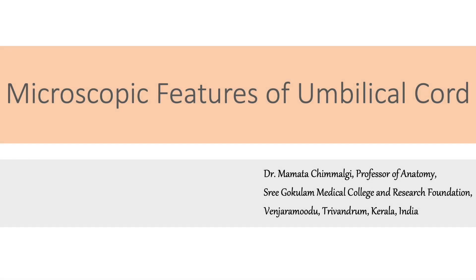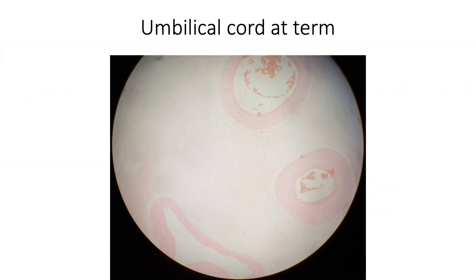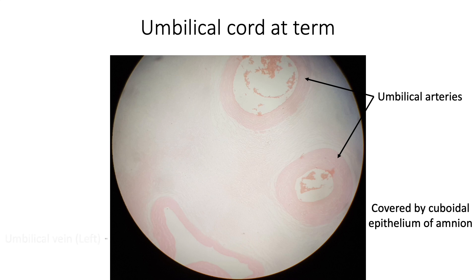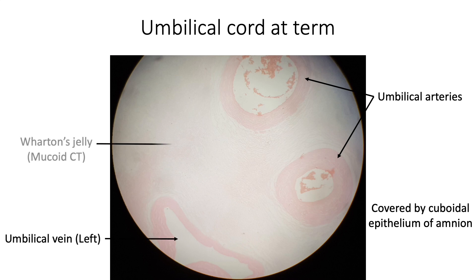In this video, let us consider the microscopic features of the umbilical cord. The umbilical cord at term is covered by cuboidal epithelium of the amnion. The section shows two umbilical arteries and one umbilical vein embedded in mucoid connective tissue known as Wharton's jelly.